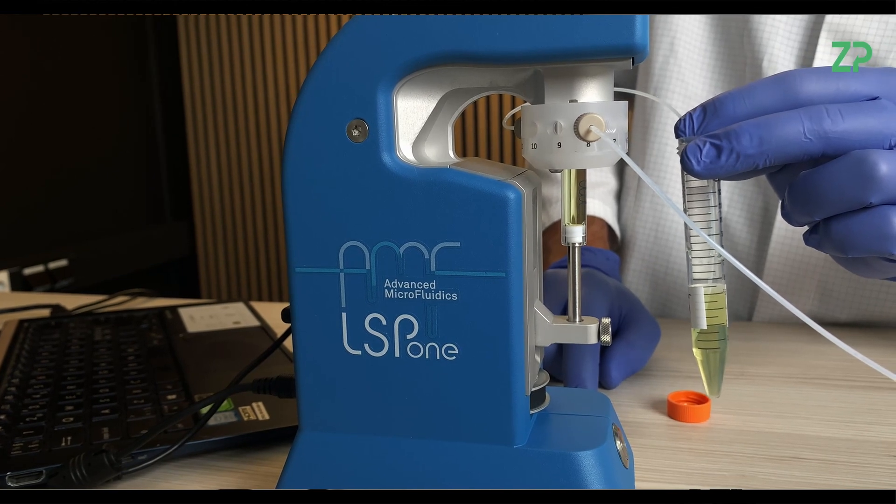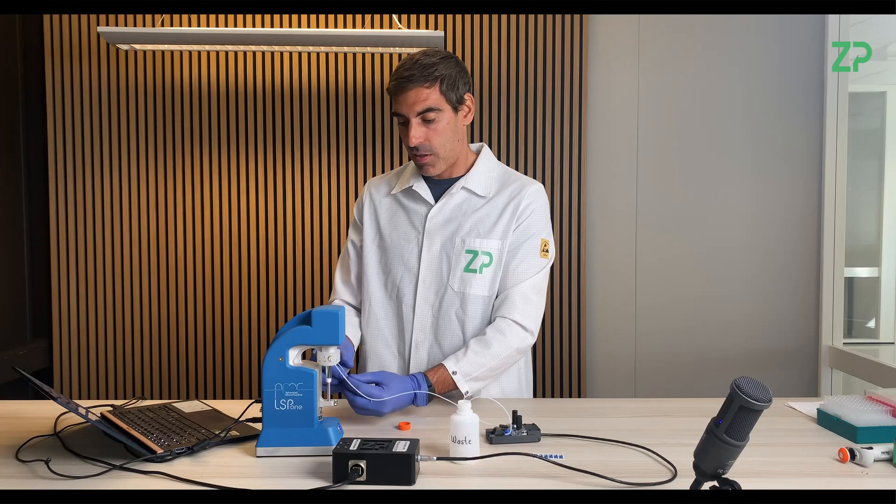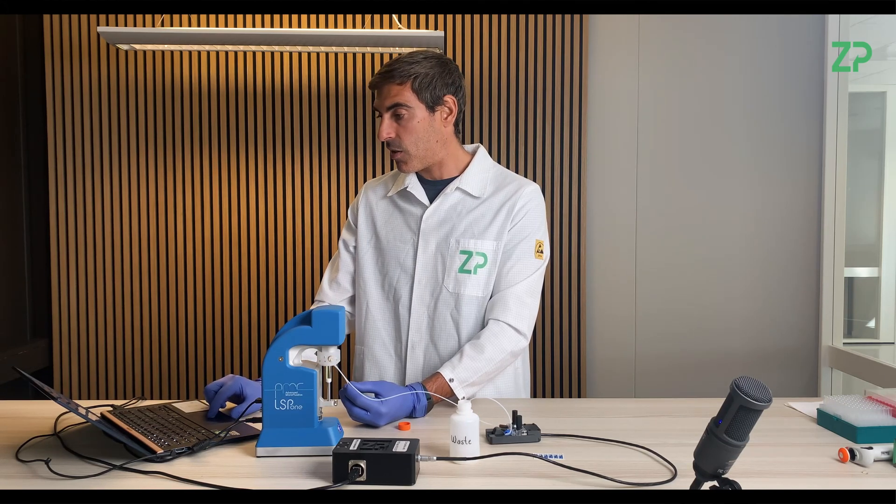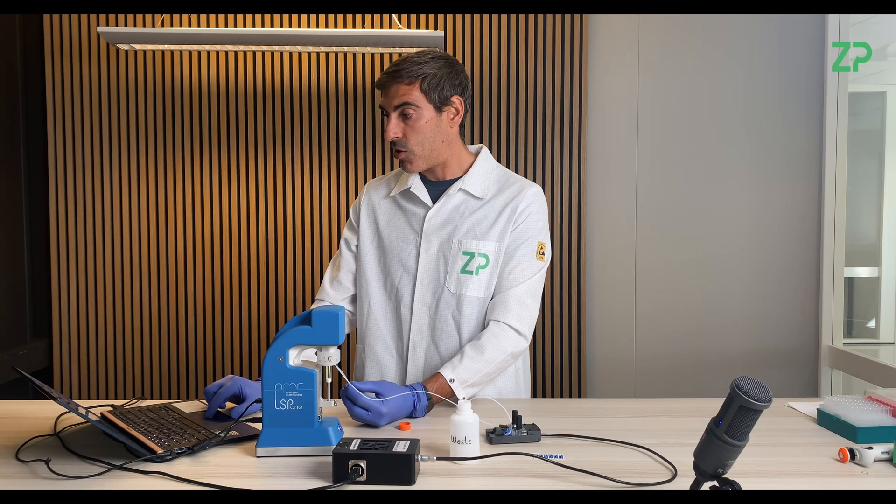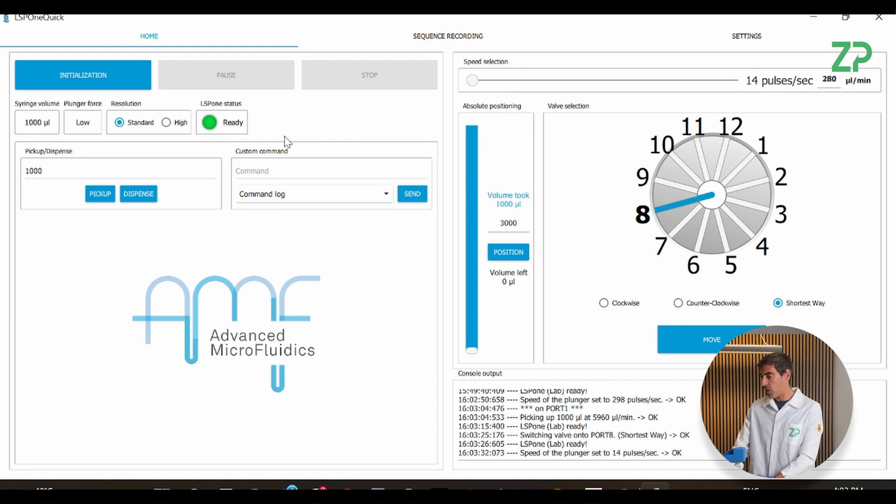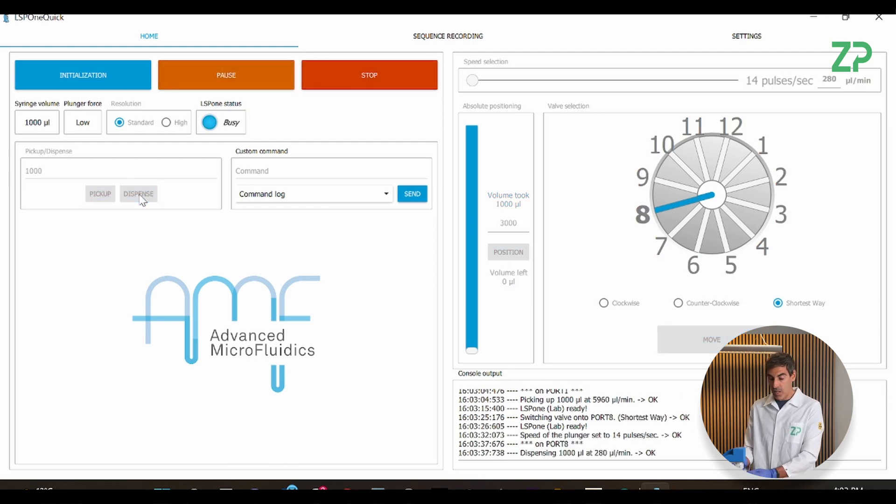Once this is done, now I'm going back to the software and I'm going to change from channel 1 to channel 8. Now press move. I'm going to reduce now the pulses to about 14 pulses per second and I will start dispensing.